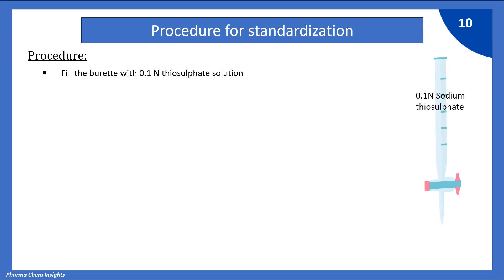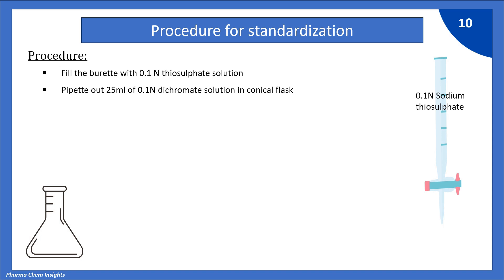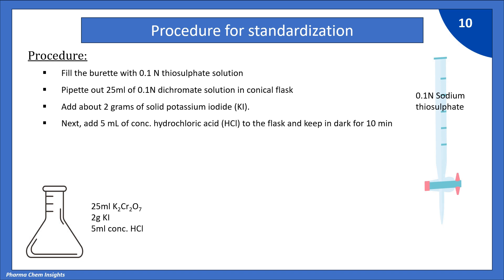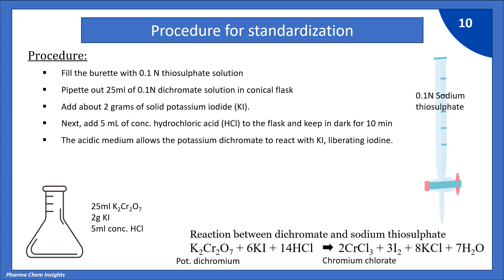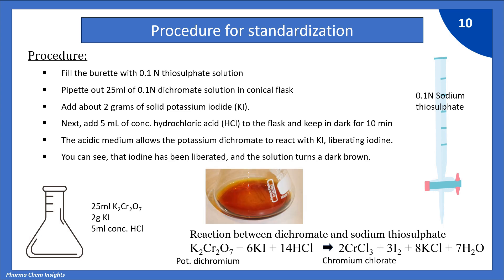Now let us see the procedure for standardization. First, fill the burette with 0.1 normal sodium thiosulfate solution. Then pipette out 25 ml of 0.1 normal potassium dichromate solution into a stoppered conical flask. Add about 2 grams of solid potassium iodide, then add 5 ml of concentrated HCl, mix, and keep in the dark for 10 minutes. The acidic medium allows potassium dichromate to react with KI, liberating iodine. K₂Cr₂O₇ reacts with 6 molecules of KI in acidic medium (HCl) to give CrCl₃ and 3 molecules of iodine.